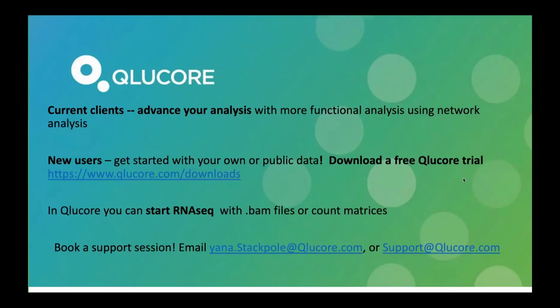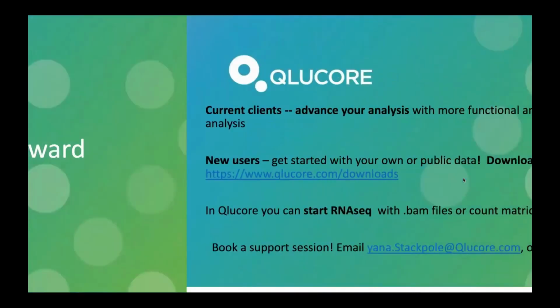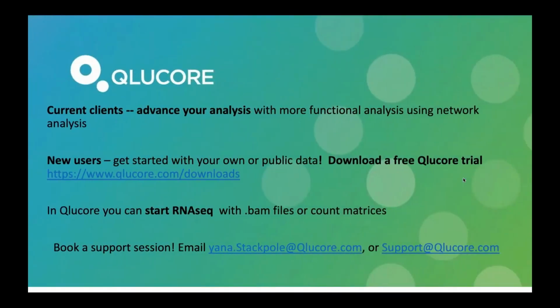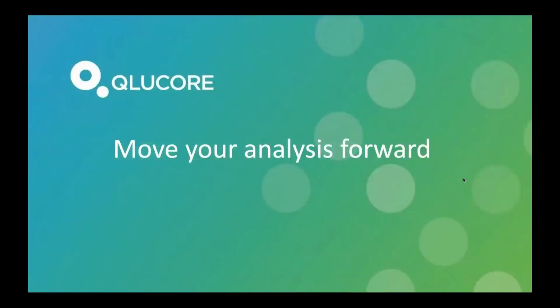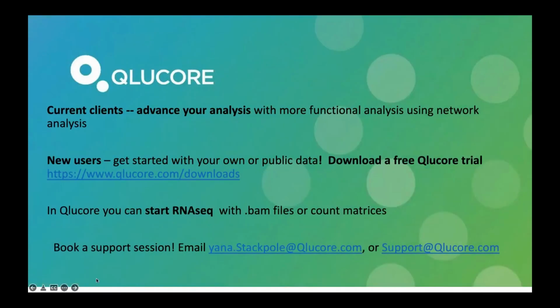For the current clients, when you have Qlucore, you can add networks easily to your workflow.